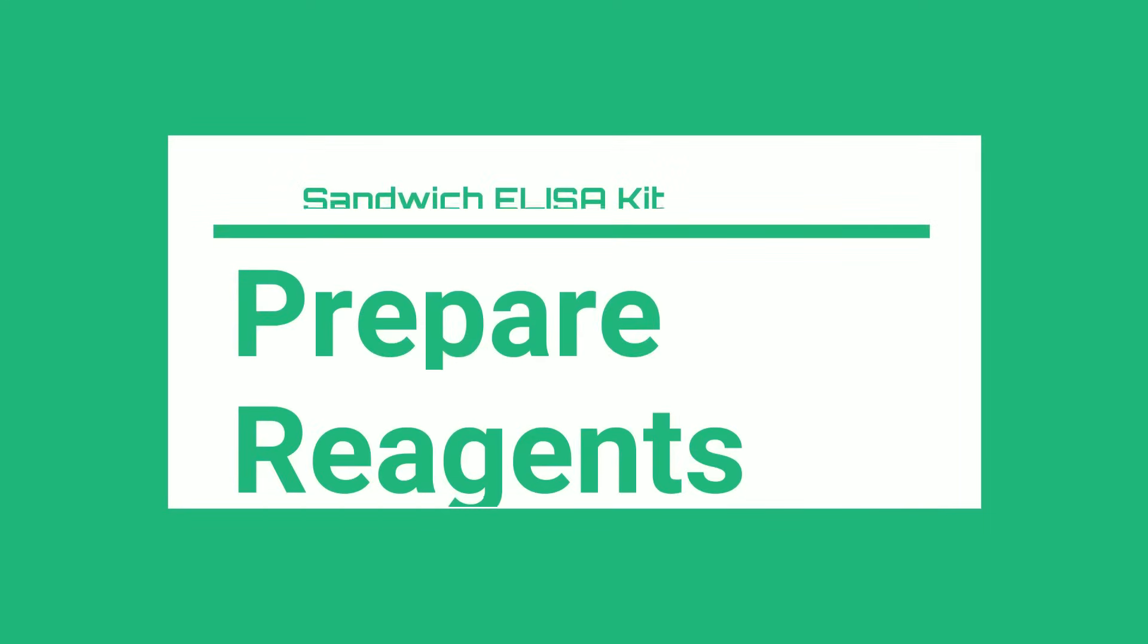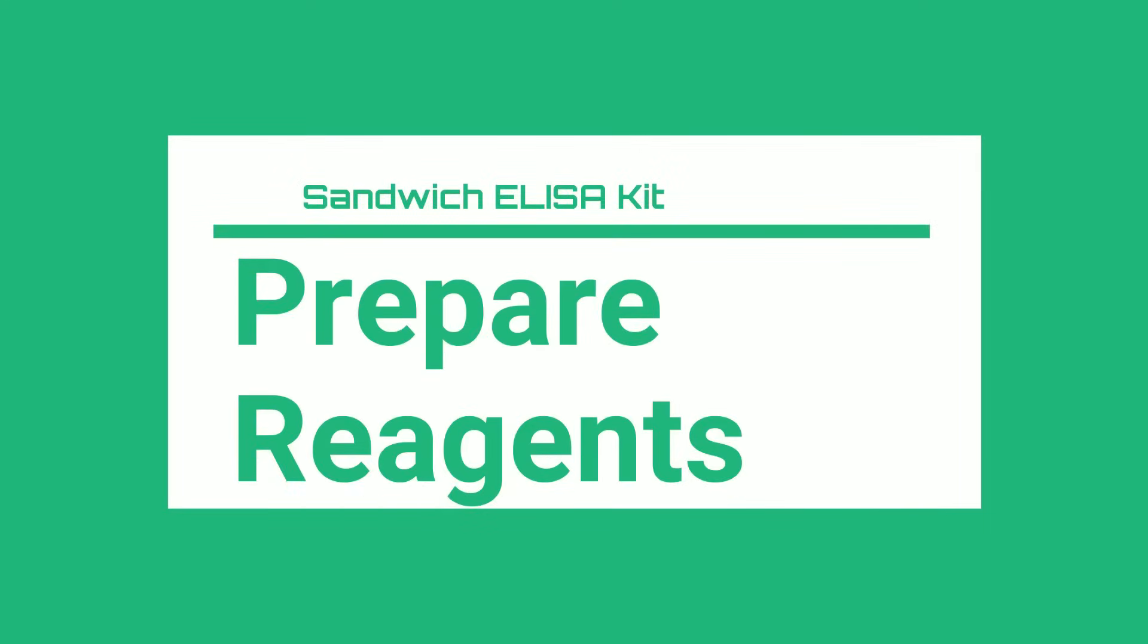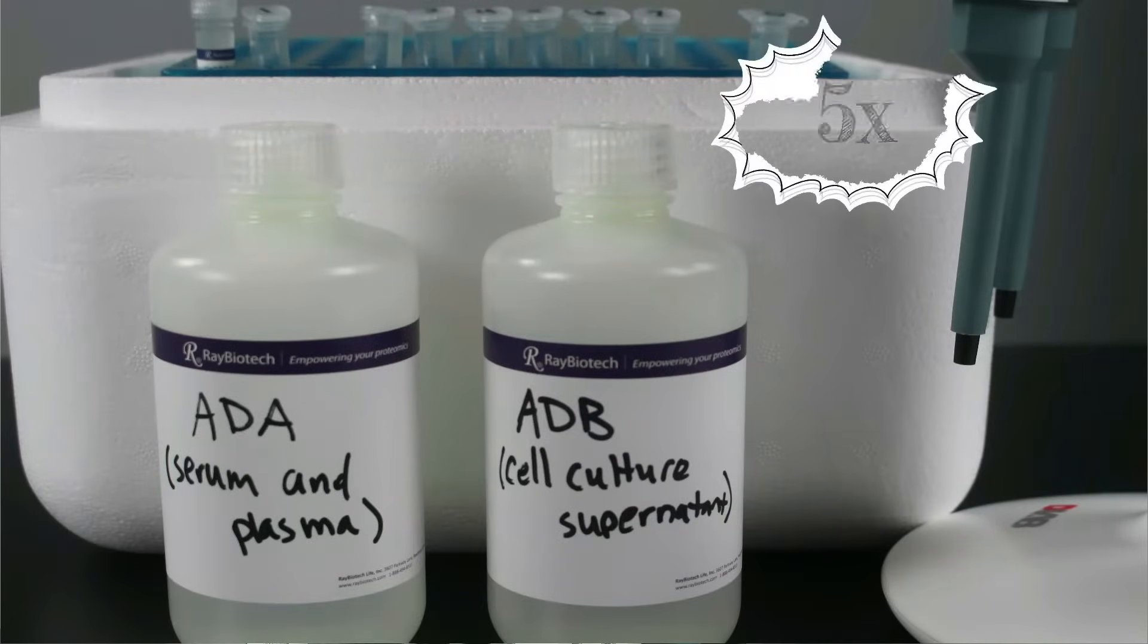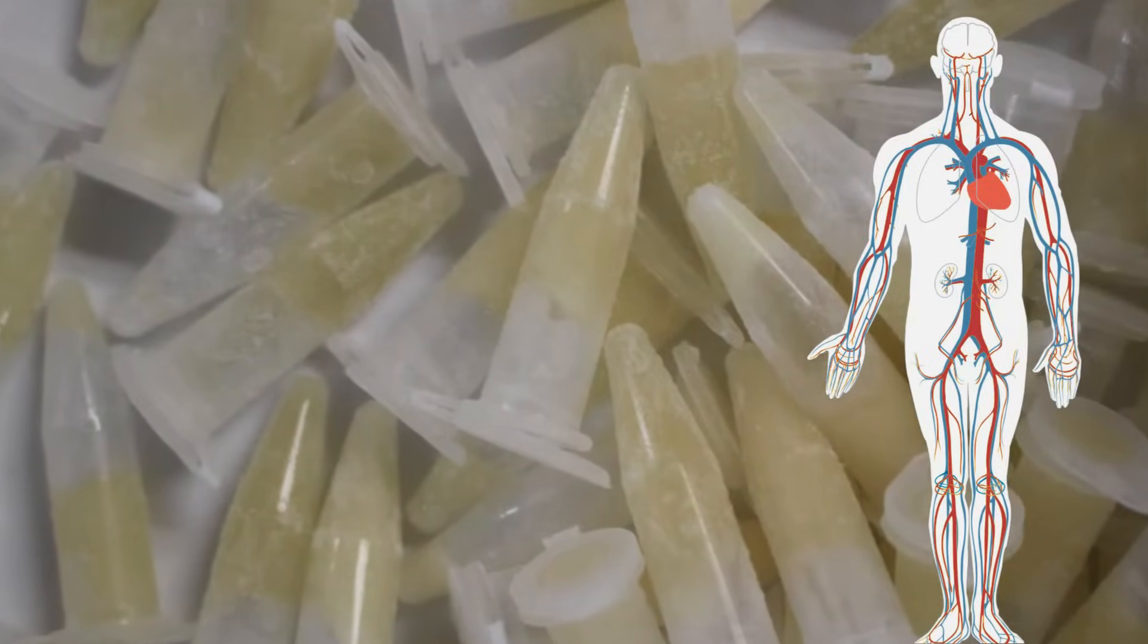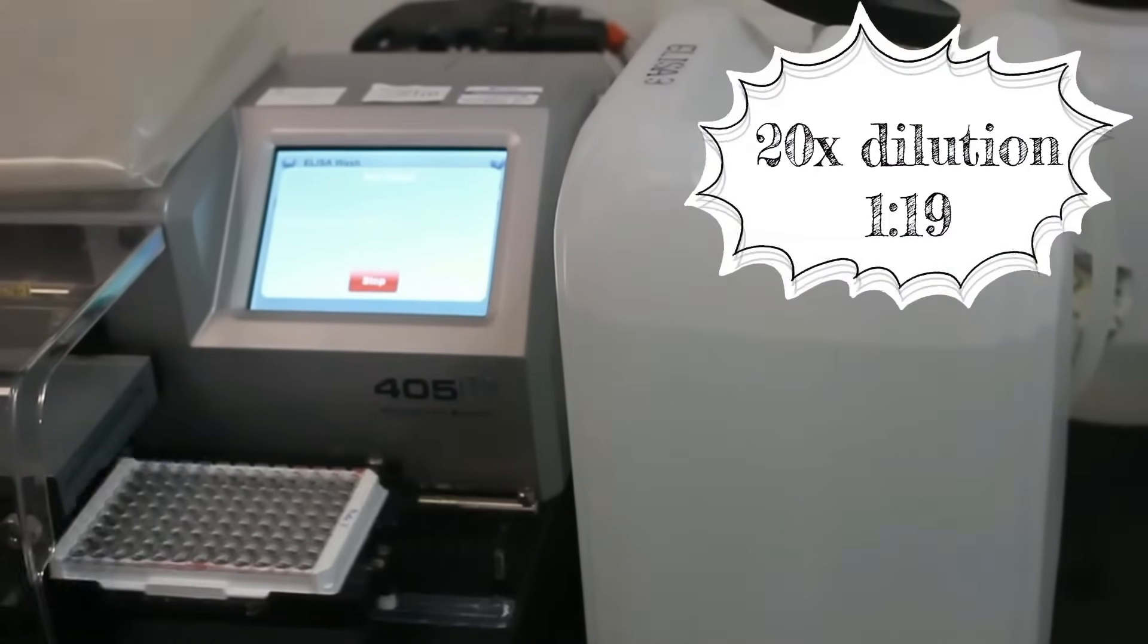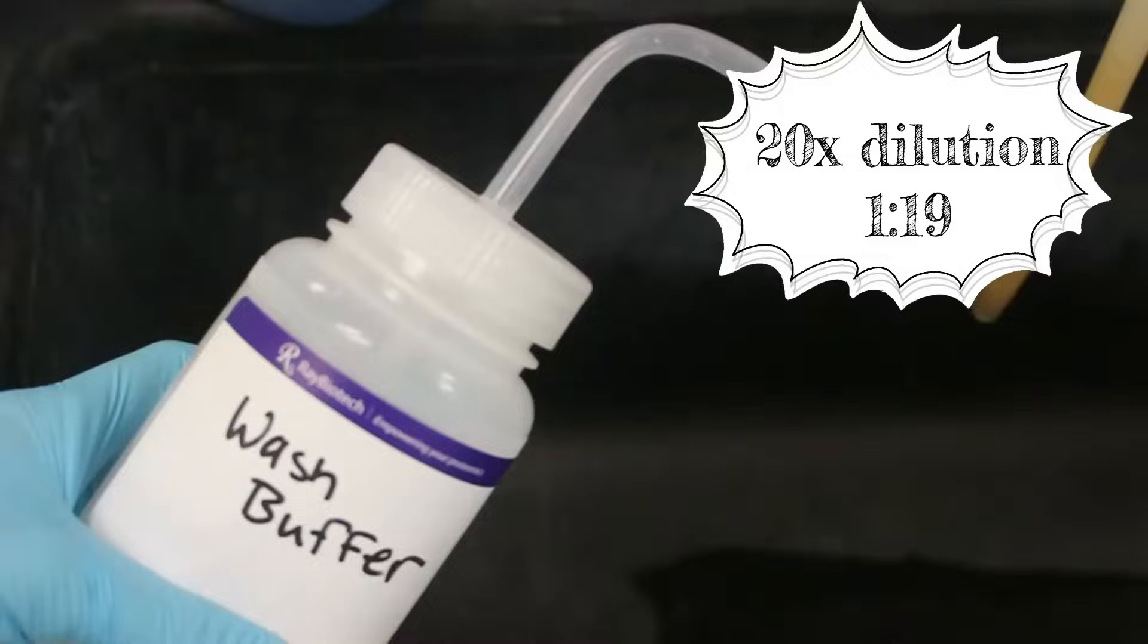Before we start, we are going to prepare our reagents. Concentrated buffers are diluted with deionized water. If using cell culture samples, you only need to dilute ADB. If using serum and plasma samples, dilute both ADA and ADB. Dilute wash buffer. Even if you already use your own, we recommend using ours.